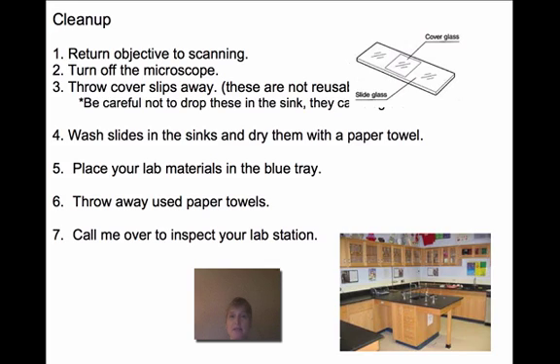Don't put it in the sink because it will clog up the drain. You have to actually put it in the trash can. So you're going to wash the slides in the sink and then dry them with a paper towel. Make sure you dry them off because if you don't, it'll leave spots on the slide and then you can't really tell those spots from what you're looking for. You're going to place the lab materials in the blue tray that is at your lab bench. Throw away any used paper towels, and then you can call me over and I will inspect your lab station.